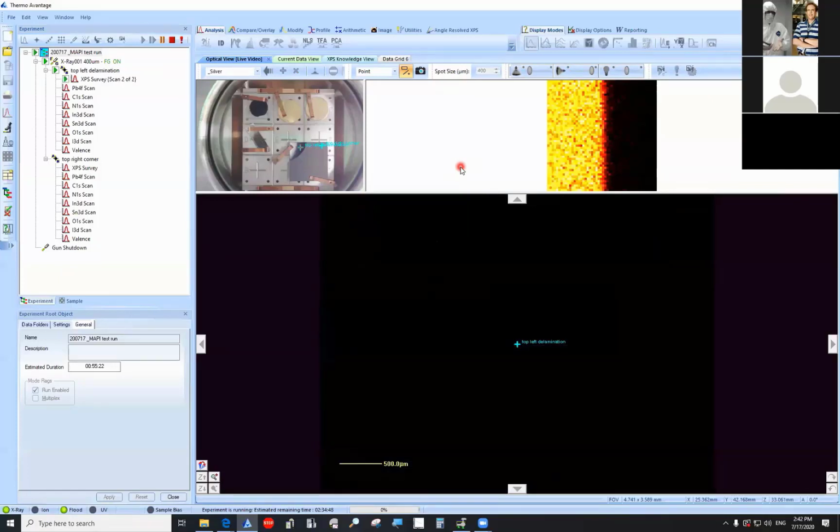All right, just as a recap, please consider going and looking at the Thermo Fisher website. Whenever you build these experiments, the way you want to think about it is configuring it with excitation source, positions, and then spectra. Excitation, position, spectra, which funnily enough spells XPS, or close enough to it.